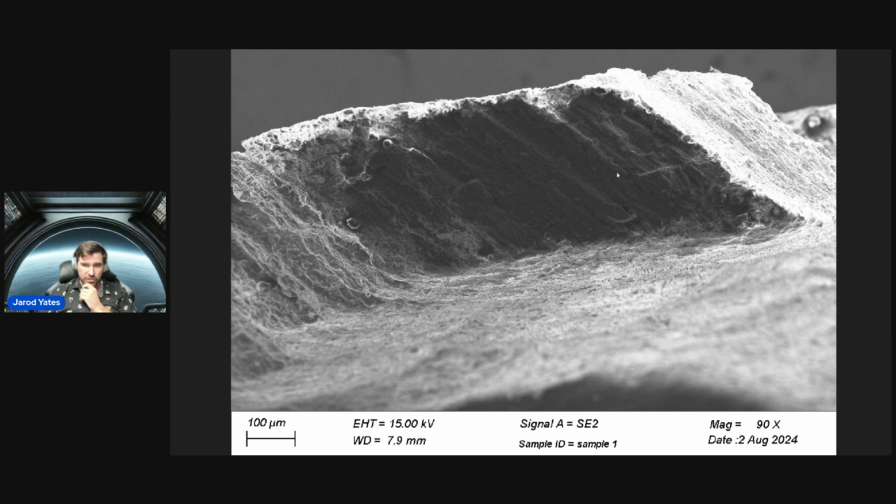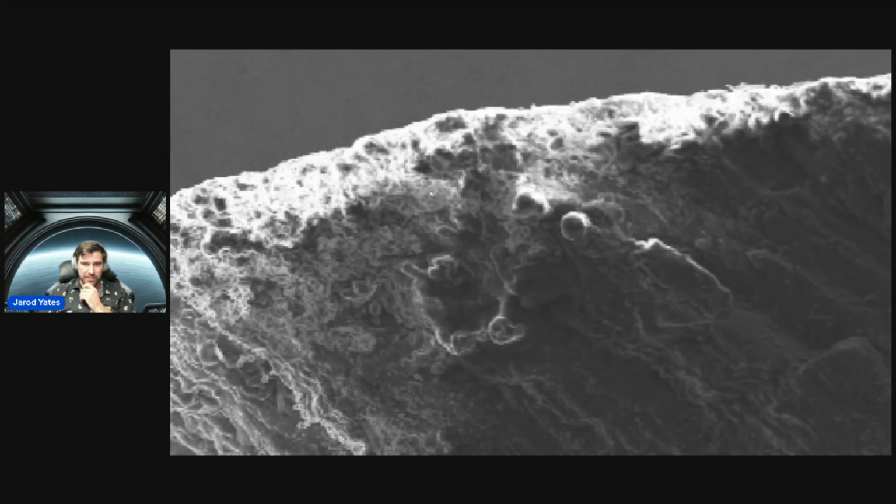You can see the striation of the columnar breaking here, but this area here, this really caught my attention. These things look kind of like little nano cylinders, and it looks like there's some connective something going on between them. I'm going to present a little bit later in this talk as to what I think is going on with these.